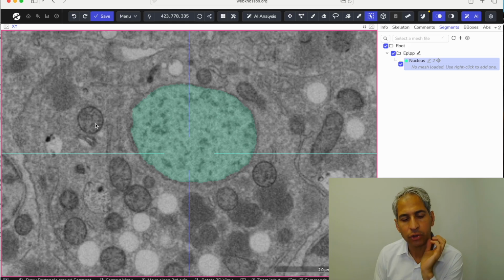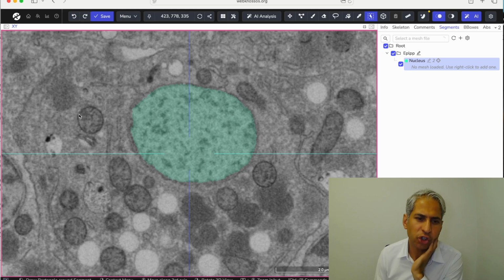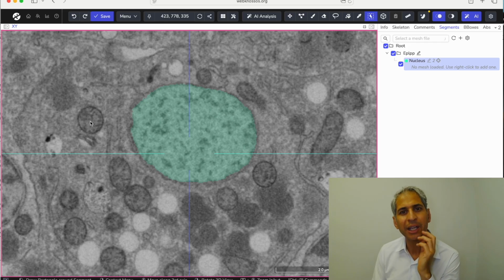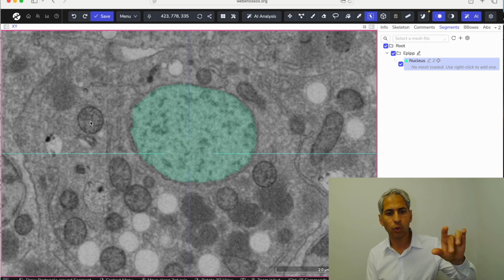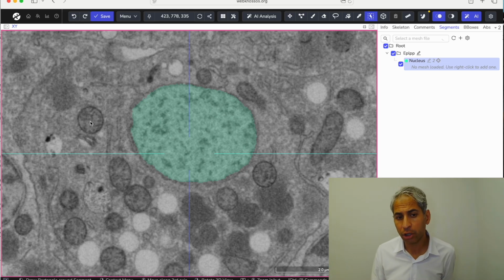Is this a mitochondria? Well, it looks circular, and I'm used to mitochondria looking like a bean shape or long tubes or noodles, or maybe like a network. But can they look circular?